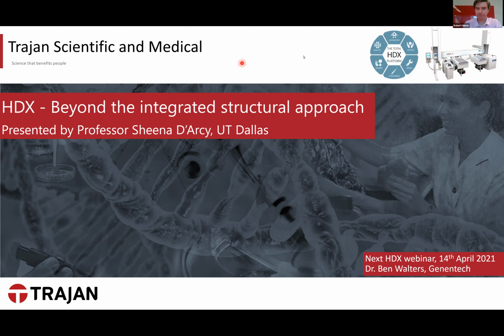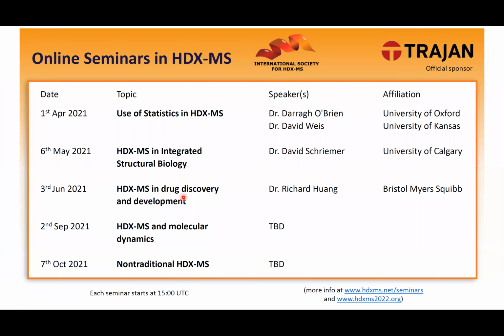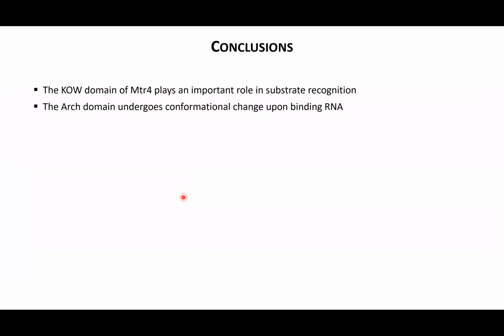Go ahead. Hi, Sheena. This is Ashish from Melbourne. I was wondering if you could comment a little bit more about how you differentiated between the binding site versus the conformational change that you observed? Because my understanding has been that the conformational change would definitely appear a bit later, like in the time course studies of the HDX.